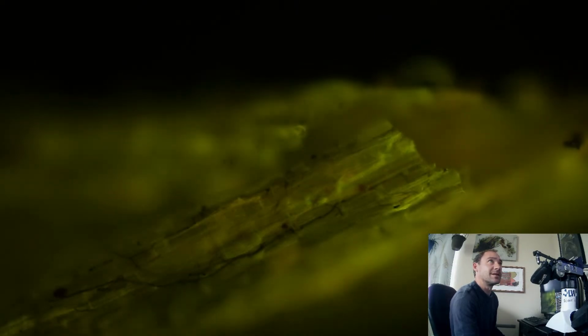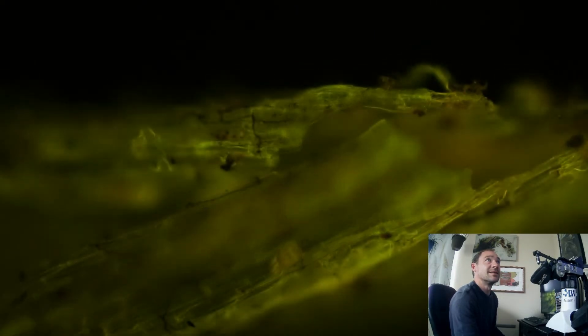But, oh yeah, very cool. Yep, so we got glowing hyphae, we got dark hyphae. That might even be a spore growing inside. That's one of the coolest things about mycorrhizae. If you get mycorrhizae roots, even if the plant dies, those roots are going to seek out and pair with other roots.